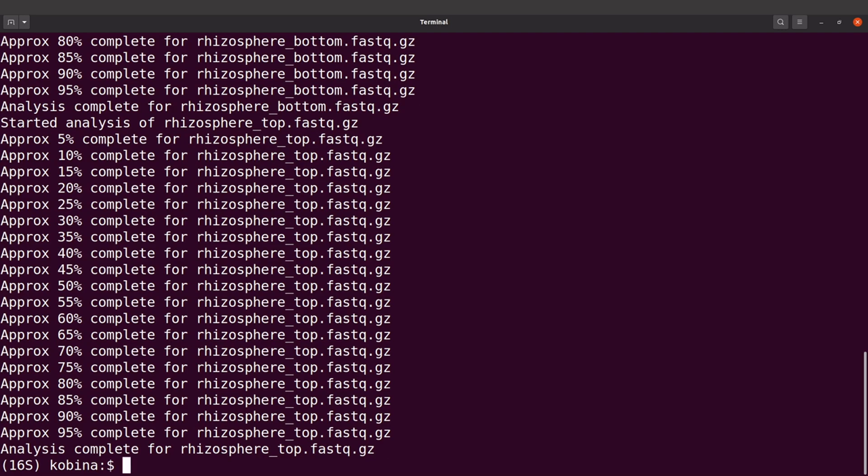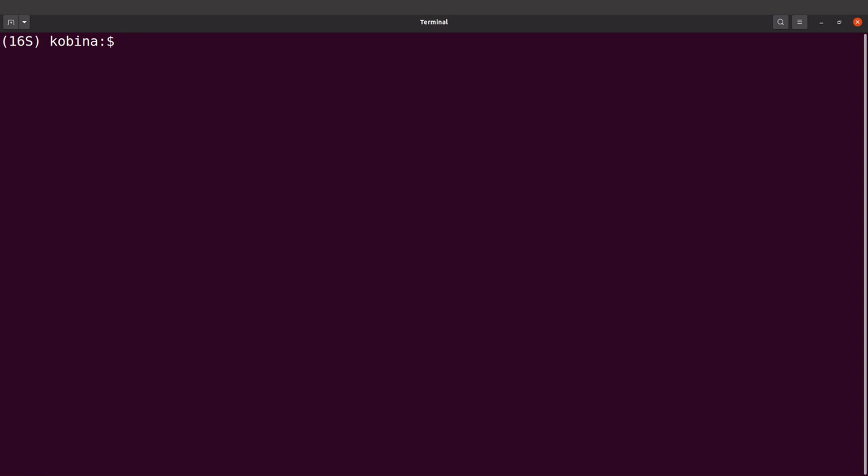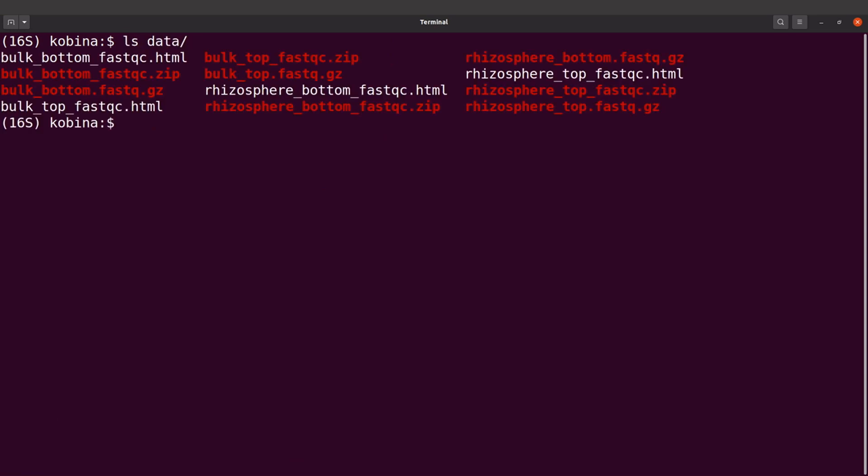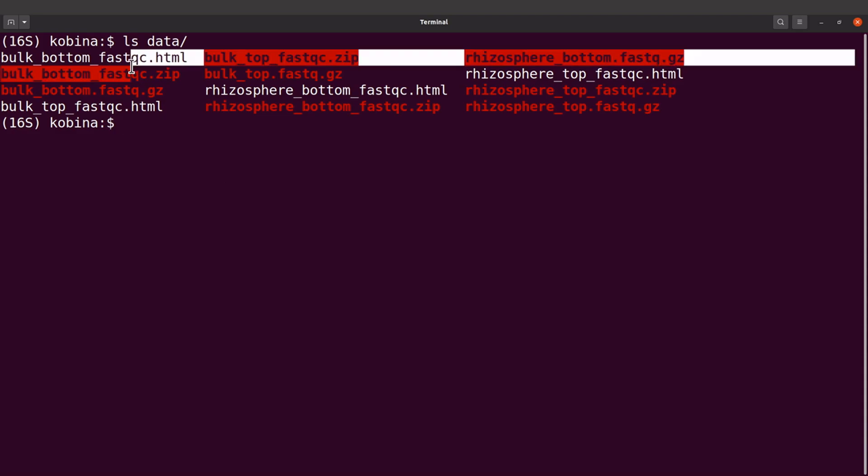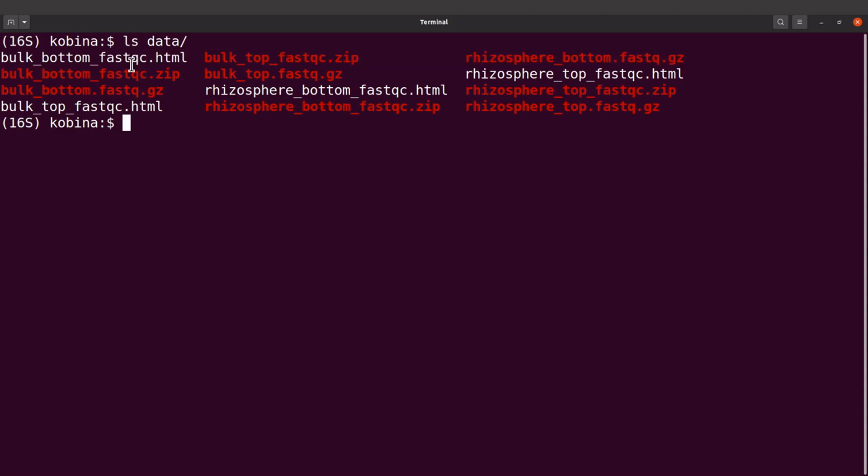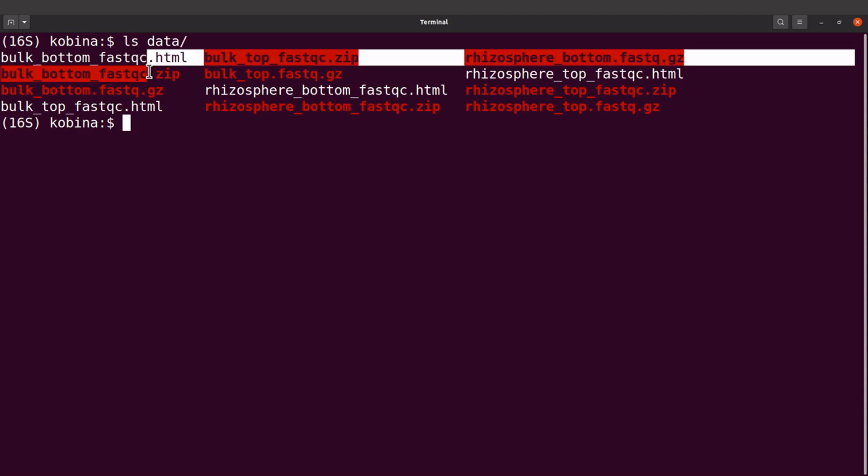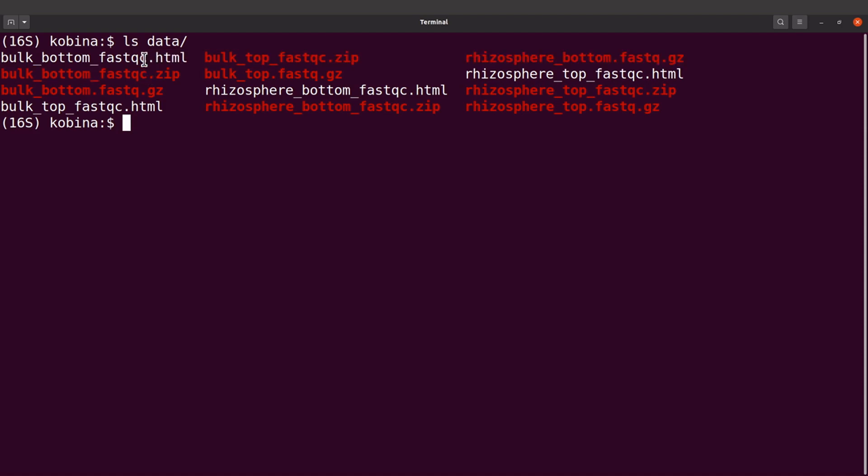FastQC has completed its work, so let's check the output files. Let's do an ls into data. We're going to see some files here. For each FASTQ file, we will have an HTML file and a ZIP file. That means we're going to have four pairs of files - HTML and ZIP for each of the FASTQ files.